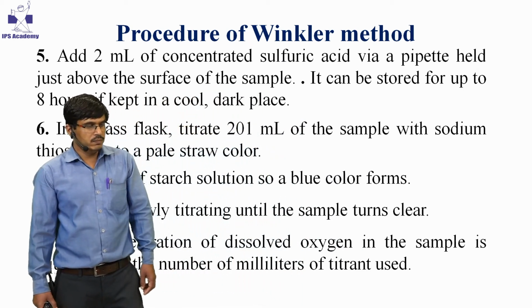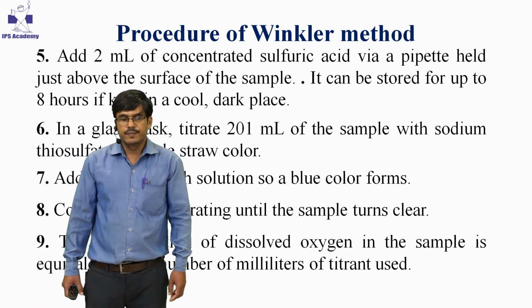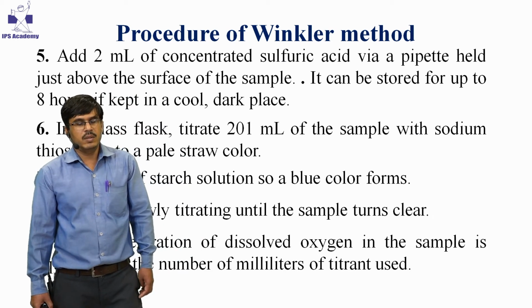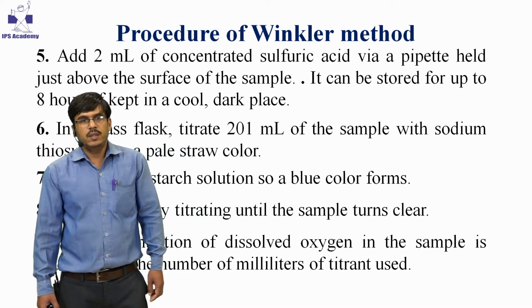Now you can determine the dissolved oxygen at the field or by taking the sample to the lab.